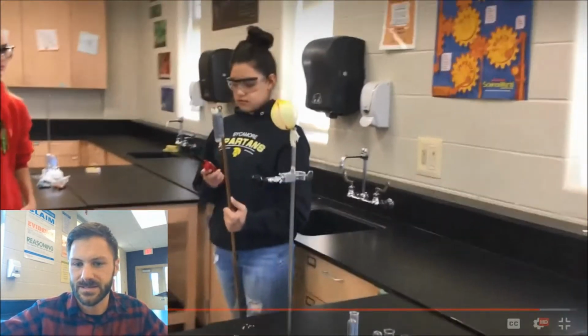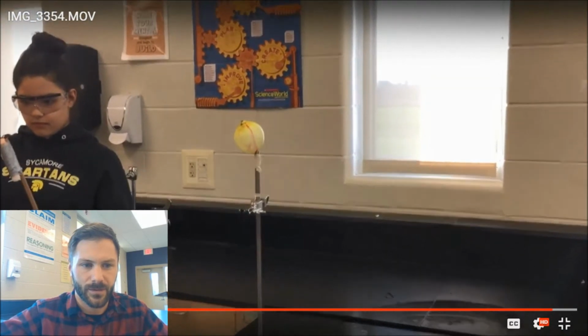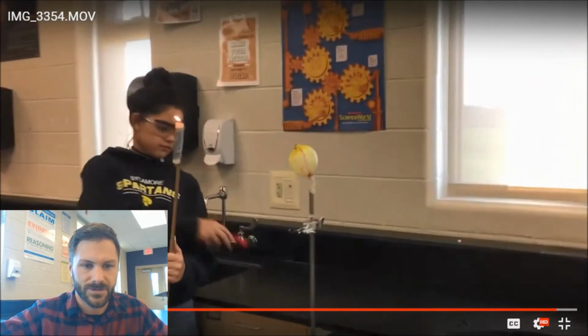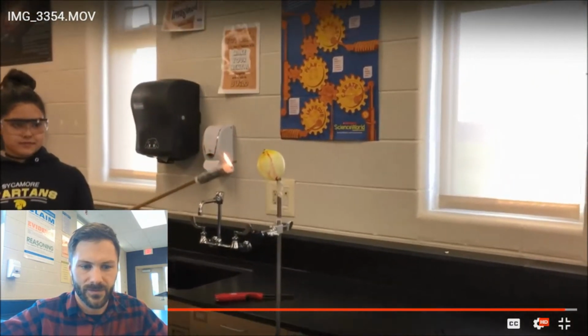Reason being is because this is going to give us another important piece of evidence. Okay, so she's getting her lighter lit. Love that she's wearing safety goggles. That is awesome. And let's observe to see what happens now.